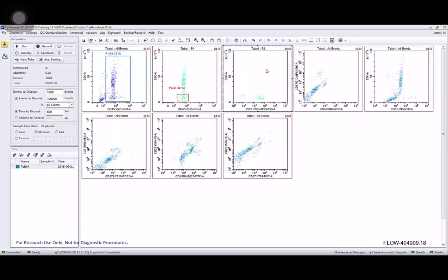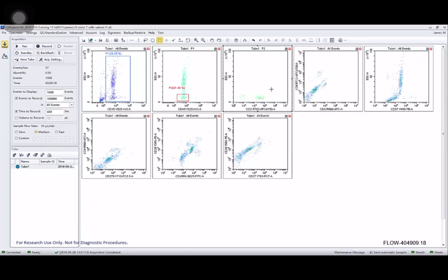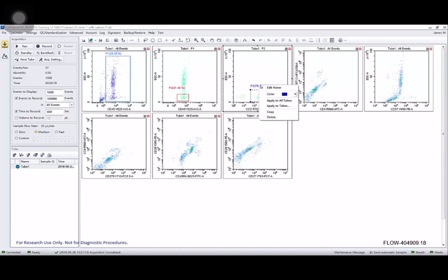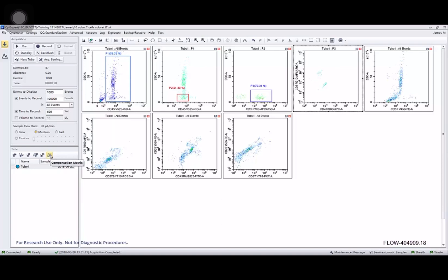And now those CD3 positive T cell populations pop right out from the leukocytes and lymphocytes. And then I'm going to import the compensation matrix and convert it based on the gains we have set up for this experiment.